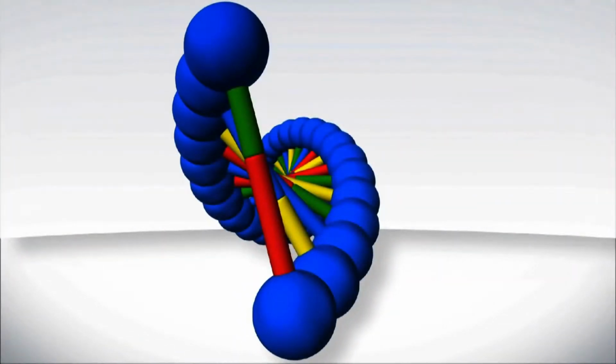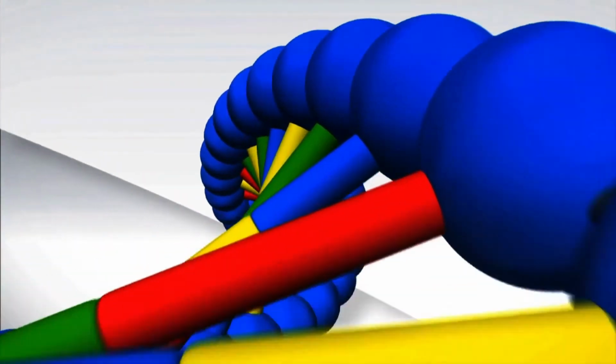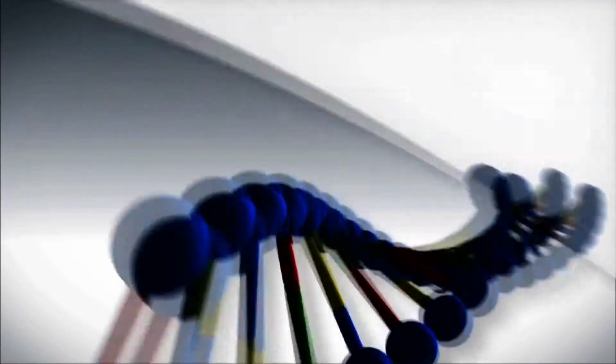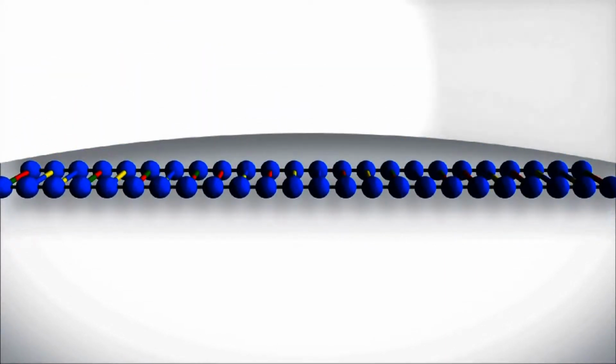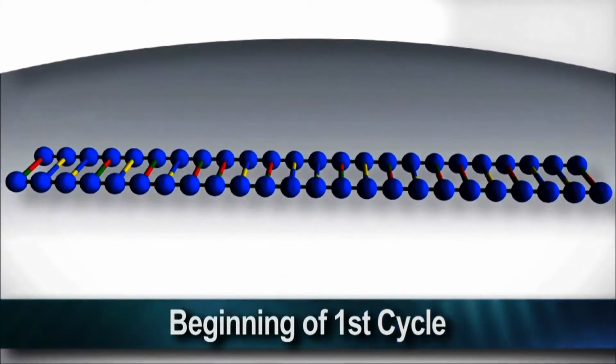Polymerase chain reaction, or PCR, is an efficient and cost-effective way to copy or amplify small segments of DNA. This allows clinicians to diagnose infectious disease, detect genetic variations and mutations, or track down the source of a viral infection, all from the DNA or RNA contained in a single cell or patient sample, such as blood, skin cells, saliva, or hair. PCR is accomplished in 3 distinct steps.